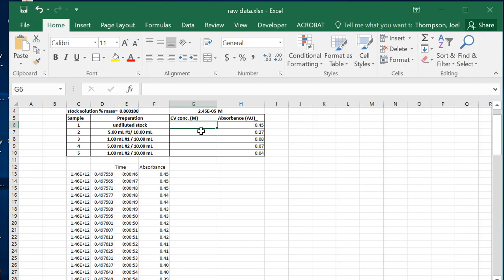So I want to just show you the power of the spreadsheet to do this. So here's my objective. The first thing is I want to show you how to set up your concentration curve and prove that it's linear within the range. And then the second thing is, if you have that concentration curve, then what we need to do is graph the kinetics experiment 3 different ways.